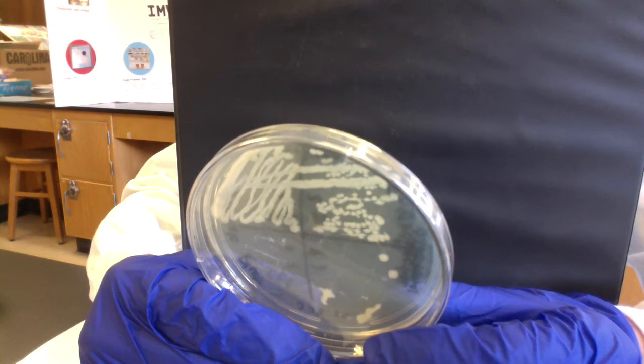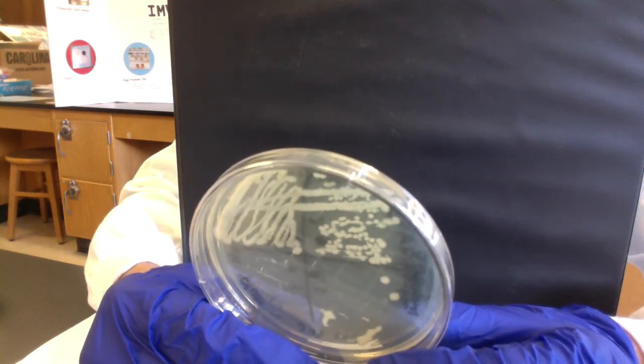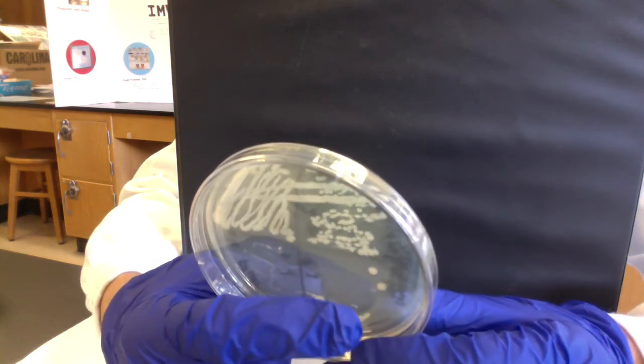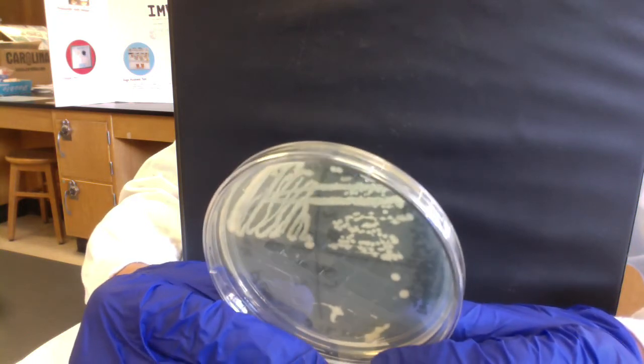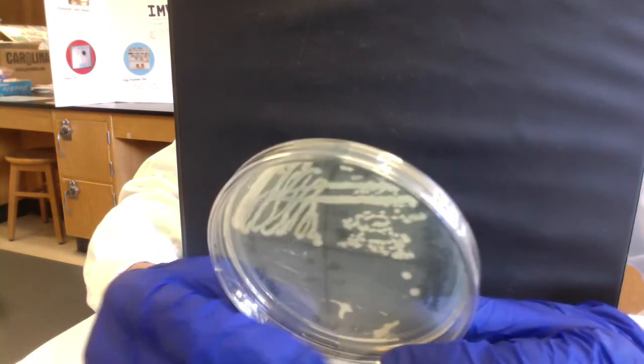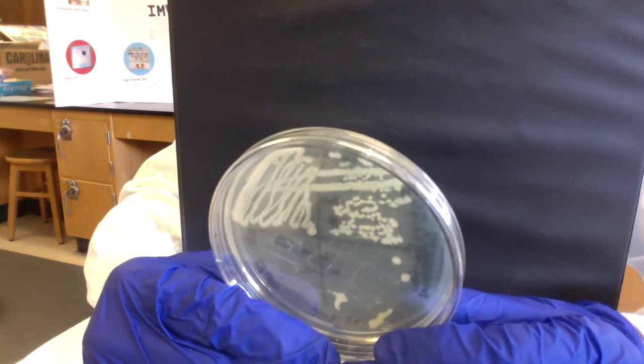All the cells in those colonies are descended from a single cell, so all the cells should be genetic clones. Thus, those isolated colonies, each colony would be a pure culture.